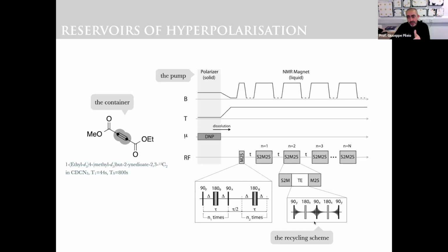And I suggest during this observation, you do a double echo and collect 4 FIDs. And then at the end of the FIDs, which you can sum up and also get a factor of 2 in signal to noise and give you the answer you want about the spin system, you then end up having magnetization.